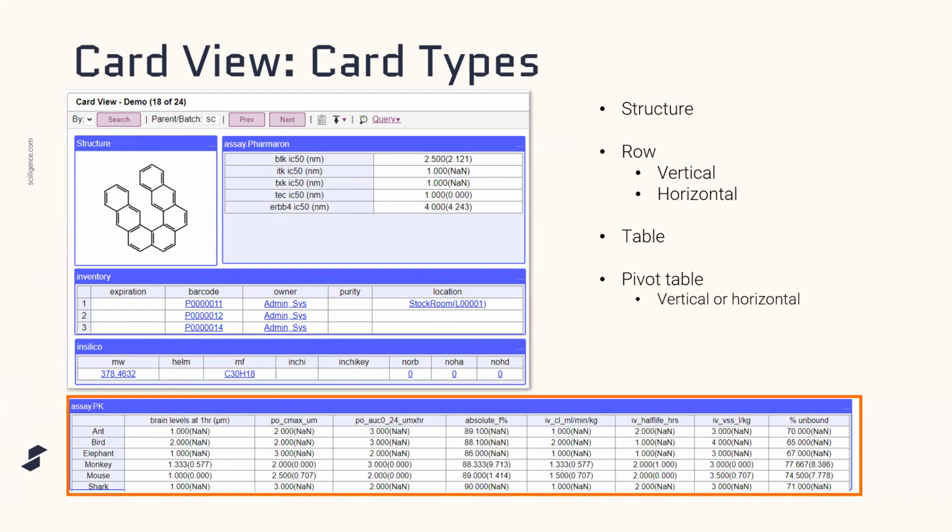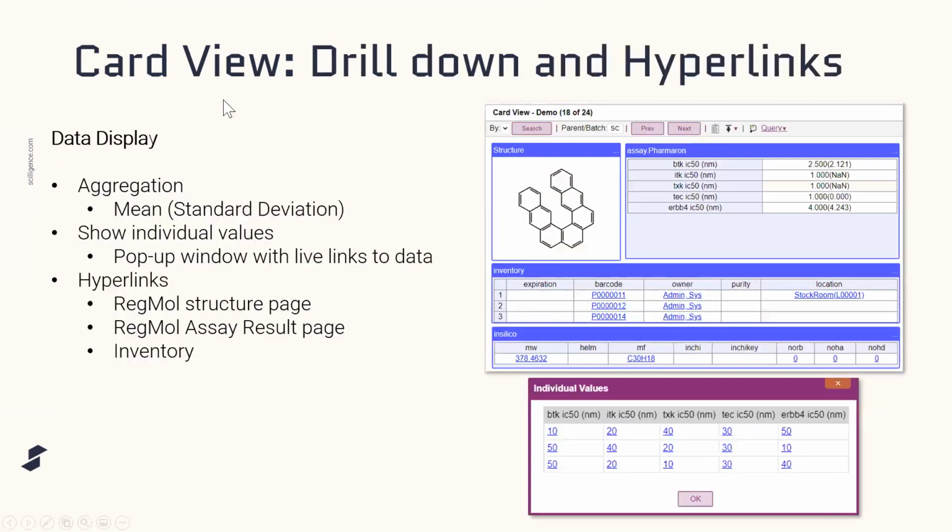If you have regmol, the rule set that the pivot table will obey can be determined using our protocol feature. So you would go to your protocol, and in the data field, you would select the group by option. We could always show you this in a demo if anybody's interested, if you have the regmol feature. All right.